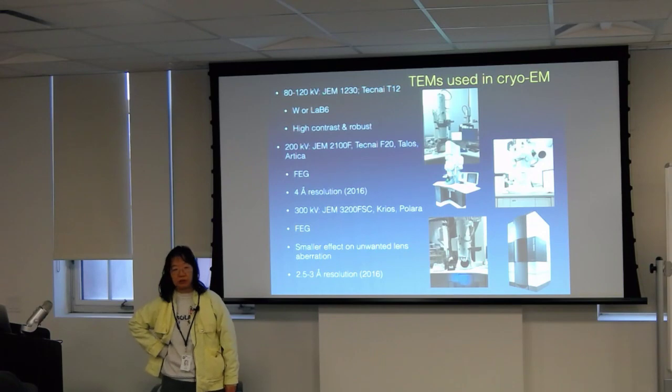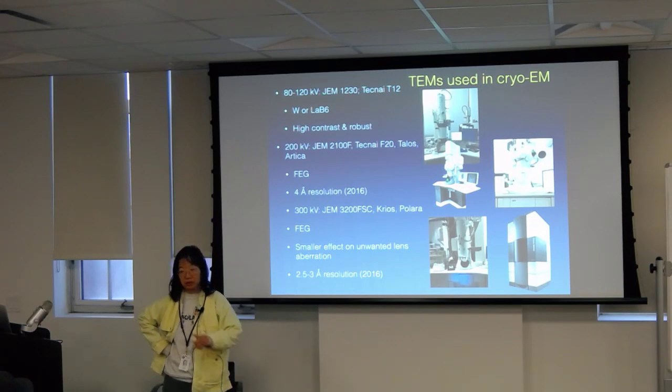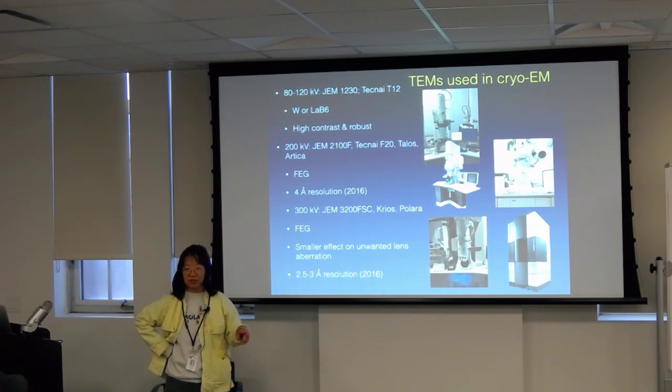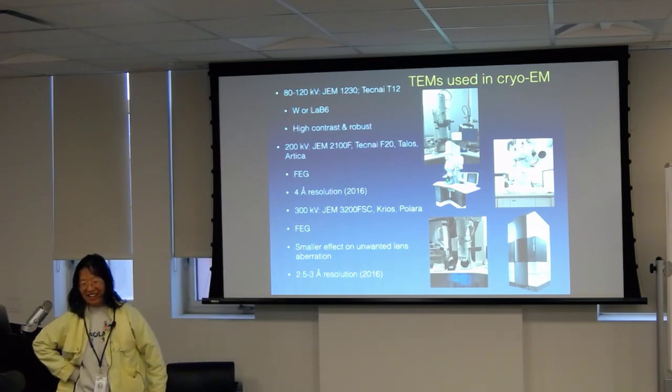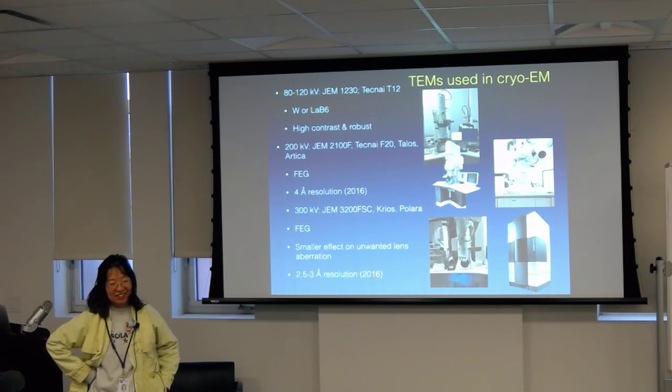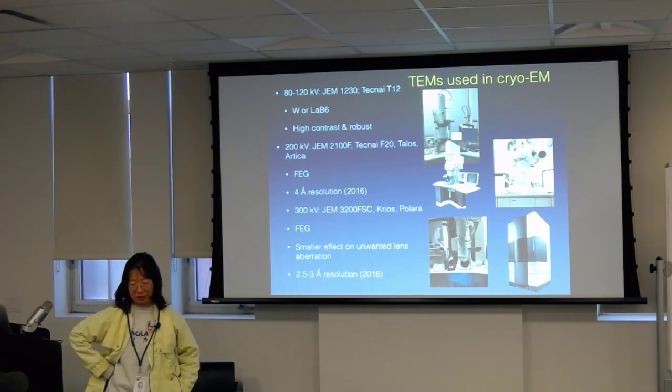reliably. Does anyone know what's the record on that now for Cryo-EM for 200 kV? You were about to say something. Okay, I think it's sub 2, isn't it? There's a report, somebody tweeted about it, so they are now getting sub 2.